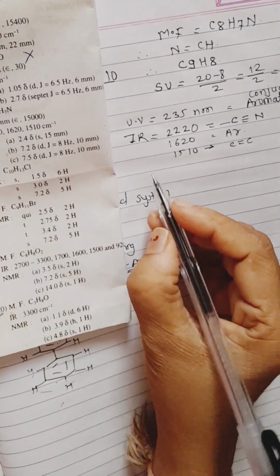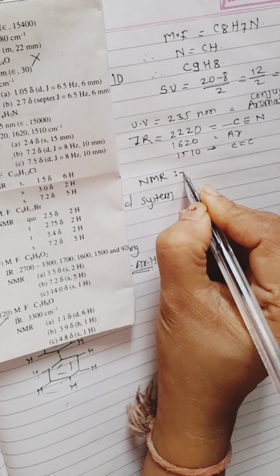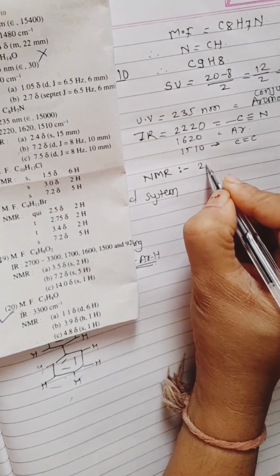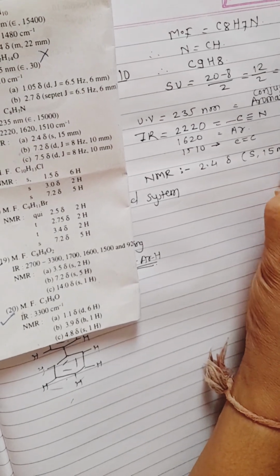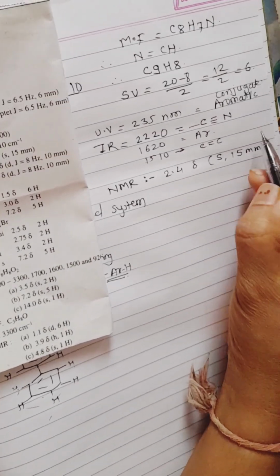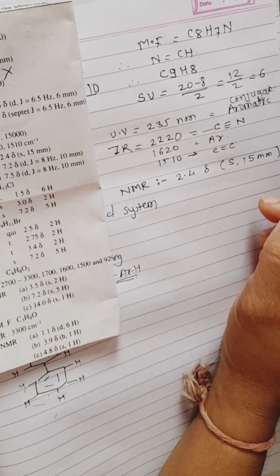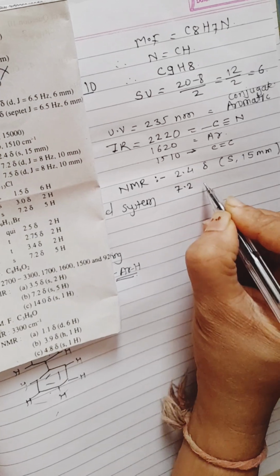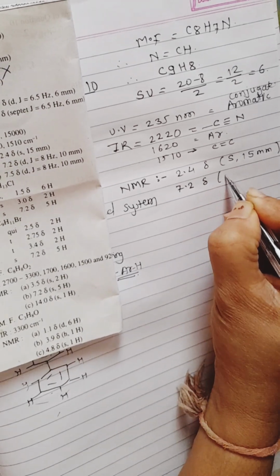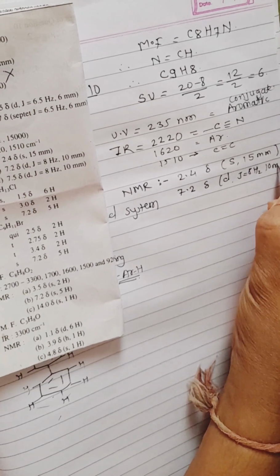Now look toward the NMR data. The first NMR data is 2.4 delta, singlet, 15 millimeters. So friends, here the area under the peak is very important to calculate the number of hydrogen atoms. The second data is 7.2, doublet, J is 8 Hertz, 10 mm.